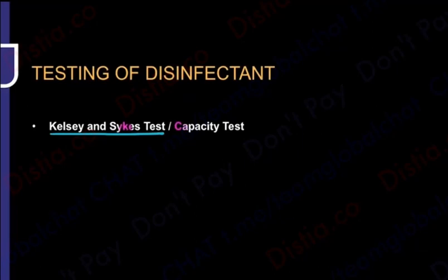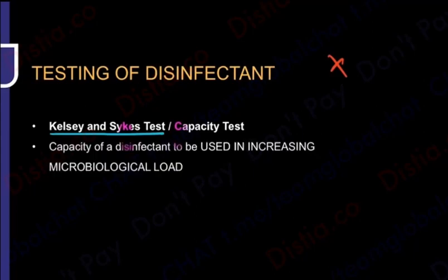The capacity. You will say, ma'am, solution X has passed. Solution X has been passed, but I'll say it has been passed one time by one test. If I put load on top of it, how many times will it work? That you don't know. If I tell you to read one page, and you say that page in front of me as it is, I'll say, wow, what a memory. But when I give you 100 pages to read, how much will you retain? That is what I'm trying to guess. If I give you too much load, how will you react? So remember, the Kelsey-Sykes test is when you are trying to see the use of the disinfectant with increasing microbiological load. So you're trying to test its capacity, how much capacity it has, like I'm trying to test how much you can read.